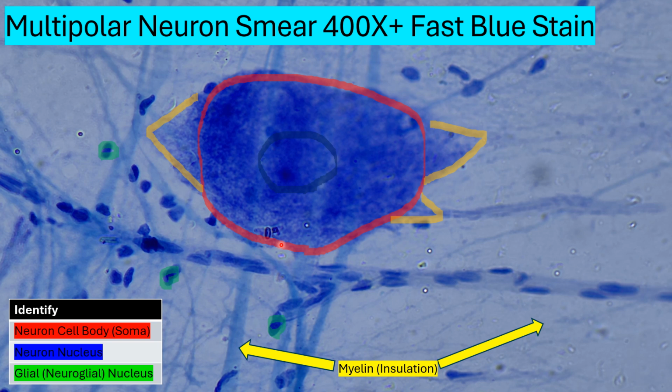So that's how we go about identifying nervous tissue. Look for the soma, the nucleus, the beginnings of these neuronal processes, as well as the glial cells that outnumber them, and the size difference between them. And that's the 4th tissue type. So along with epithelial, connective, and muscle tissues, it makes up larger organs that ultimately make up larger organ systems and then the living organism. Again, nervous tissues can be difficult to discern, but look for these three parts, as well as the beginnings of the axon and the dendrites, is really key to identifying it.